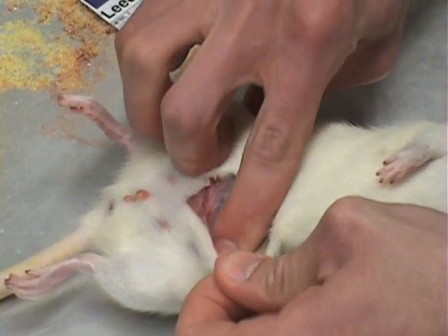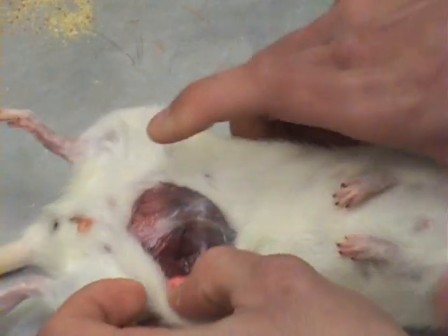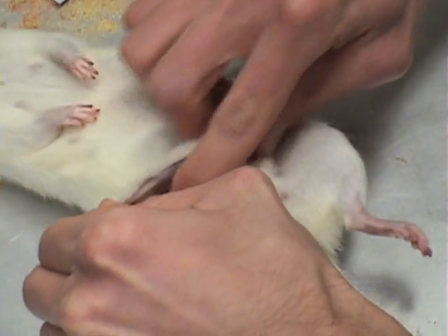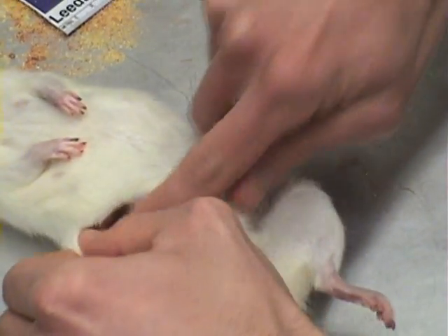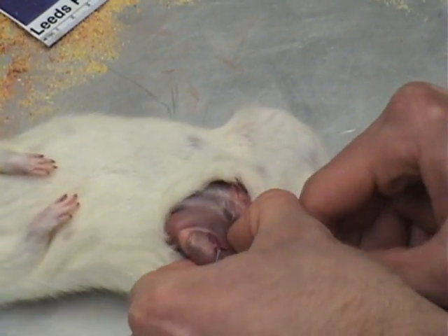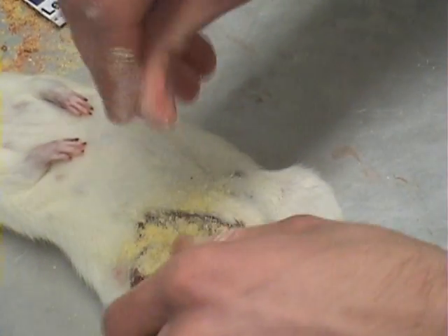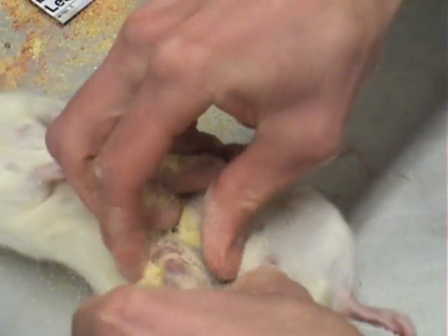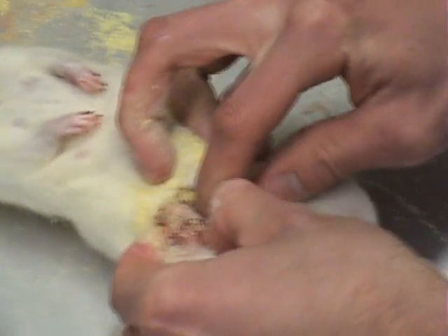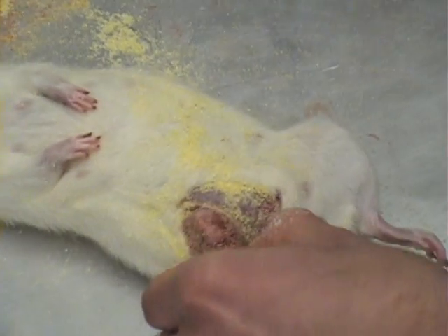Gently push your fingers in between the skin and the visceral and separate them. Once the skin is sufficiently moved away and the knee joint is visible, gently move the knee joint up. You may need to apply a small amount of cornmeal to absorb any bodily fluids. Work the knee joint up until it is clearly visible, then snip the joint with scissors or wire cutters if it's for larger animals.